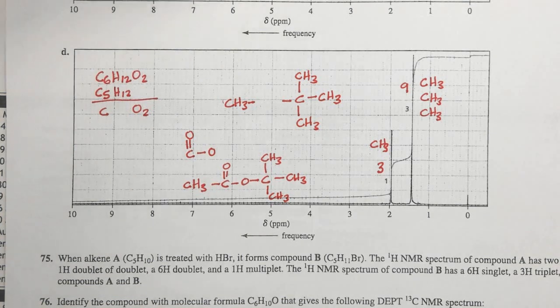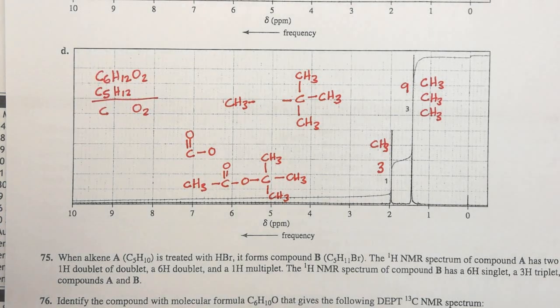So I hope you enjoyed this series of solving NMR spectra. Go through each one carefully, see if you can do it for yourself, and have some fun.